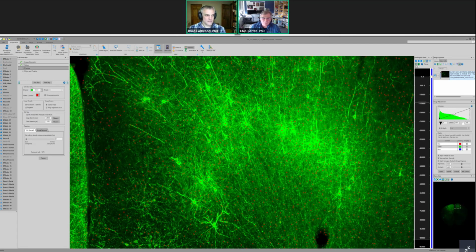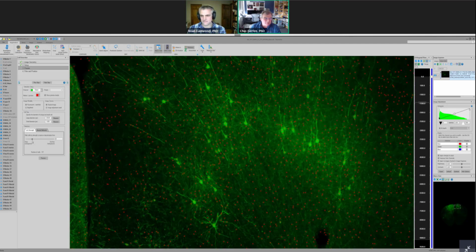And so the idea is that we move this cell strength value over, and you can see as I move it over, the things that are over areas that are pretty dark disappear first. Then move it over a little more, and you still see things, and those are typically over areas where there is some brightness. These are processes, the dendrites and things, they still are picked up, but we can move it over all the way till we see almost only the neurons labeled, the pyramidal neurons. Although here you can see that for this pyramidal neuron, the dendrites are so thick that they're also picked up. But this works.